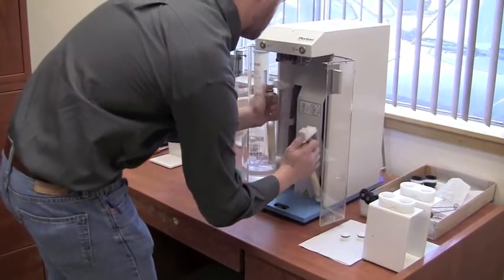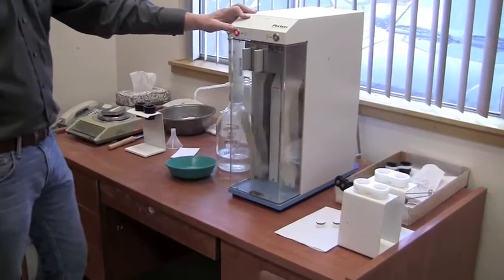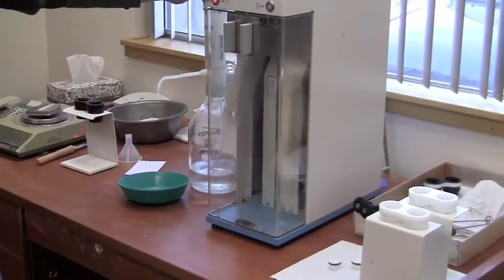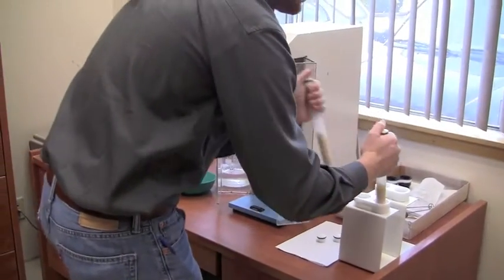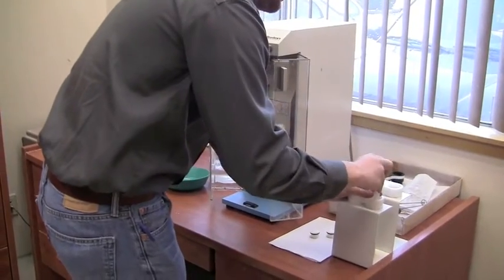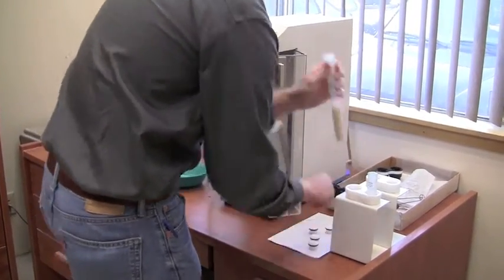This is an automatic shaker that will shake it 20 times. He will now take the stirring rods and scrape the inside of the test tubes.